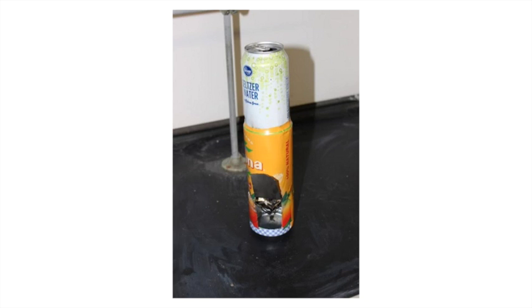Now, in order to determine the calories in our food, we must use a calorimeter. A calorimeter is a device used to measure energy and allow the observation of changes that occur during chemical reactions. These devices are used to determine the amount of energy that is contained within any given substance. Our calorimeter is unique because it has two cans which have been conjoined to create a pathway for the rising heat. This heat moves directly to the base of the top can in order to heat the water as efficiently as possible. In the bottom of the can, we have a grill-like platform made out of aluminum foil that holds the food as it is burned. The open flaps on either side provide good airflow to the fuel.